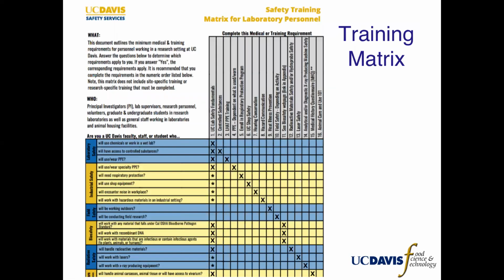Here's an example of a training matrix. These will look different depending on the types of hazards present in the labs you will be working in. Different hazards may require additional training.